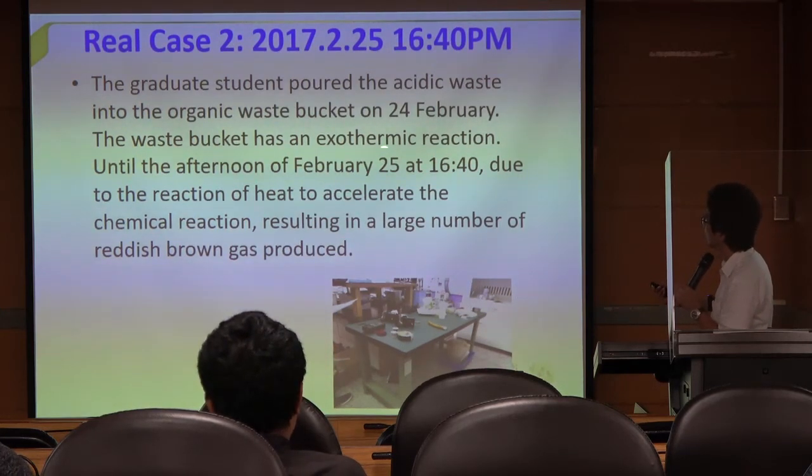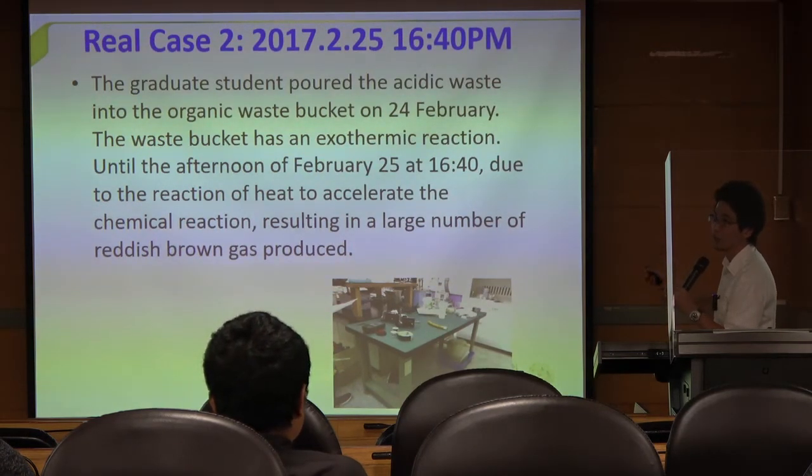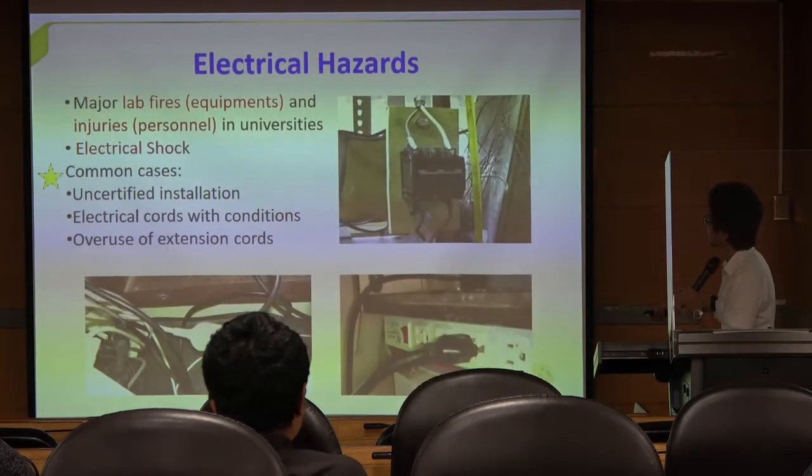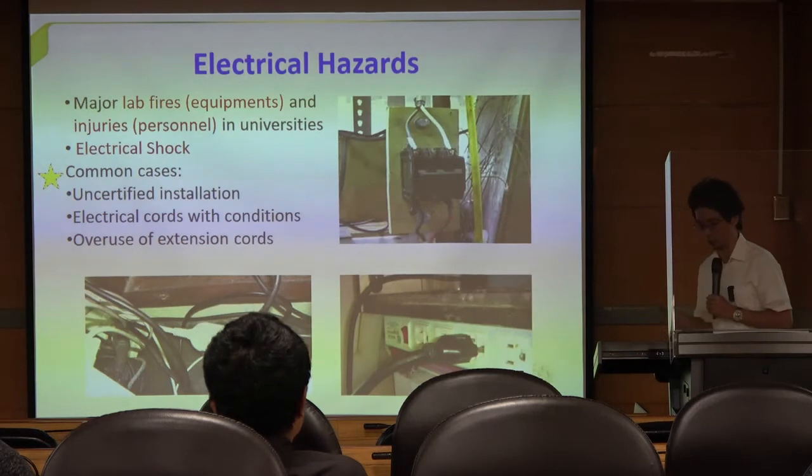And then the smoke fired in the next day. So you cannot imagine those two reagents still reacted in the bucket. So just be cautioned. Okay, so only two real cases for the chemical reagents. I can show you another hazards real case at NTSD.